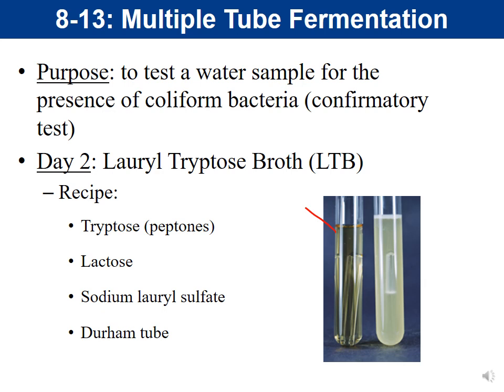So what that tells us is that there's no gram-negative bacteria in the water, right? So no turbidity. That's one result. And so is that positive or negative for coliforms? The answer is that is negative for coliforms because there's no gram-negative bacteria.